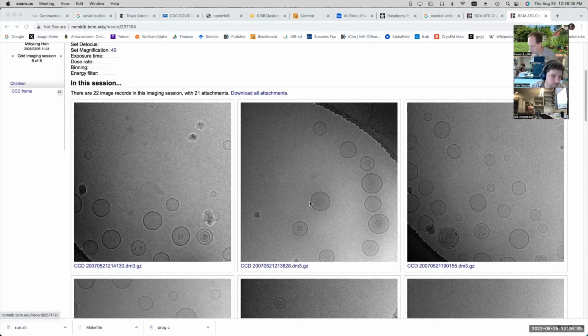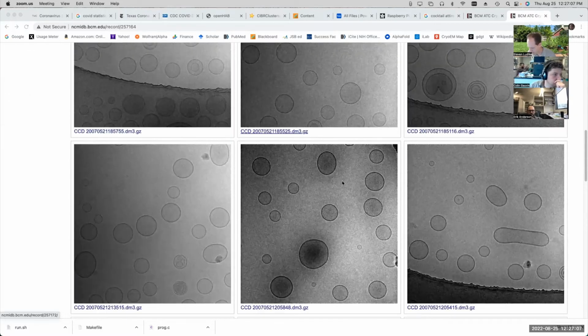The reason you see the dark edge around the outside is because you're looking through a tall vesicle. You're looking at the profile of the lipid bilayer here. So you're looking through a large number of phosphates on the edge, and in the middle, you're just looking through 4 layers, right? The inner and outer leaflets on the front and back surface of the vesicle. So the strong density that you see there is due to that fact.